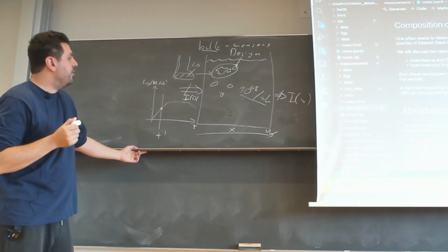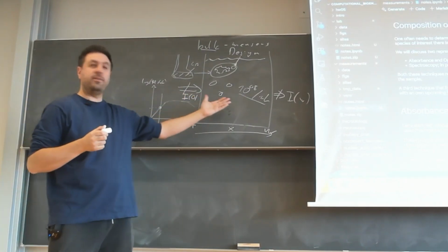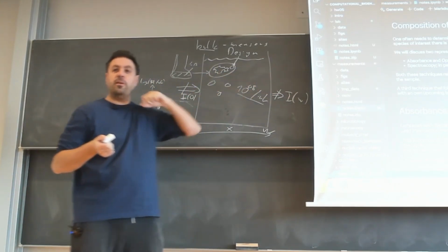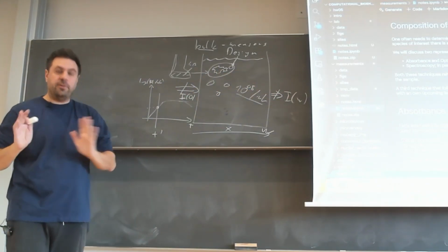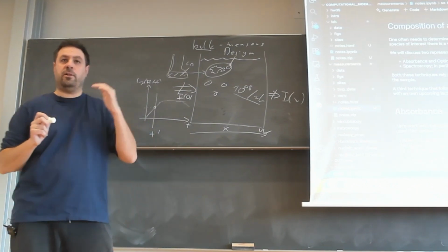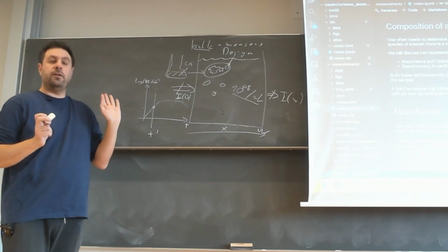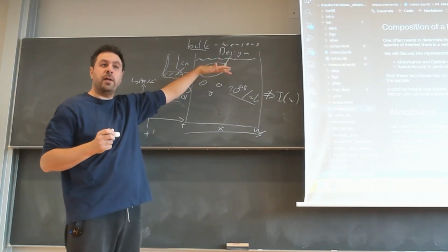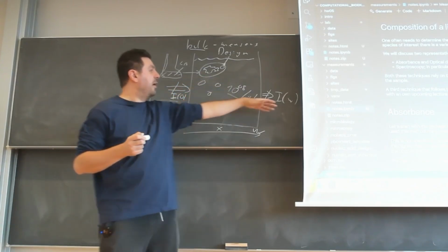There is some information in this. Conceptually it's clear: the more there is inside, the less light we are supposed to get here. There are, of course, conditions, like as long as this thing interacts with or disturbs the rays of light going through. If you are dissolving sugar in this, unfortunately you will not see much here.